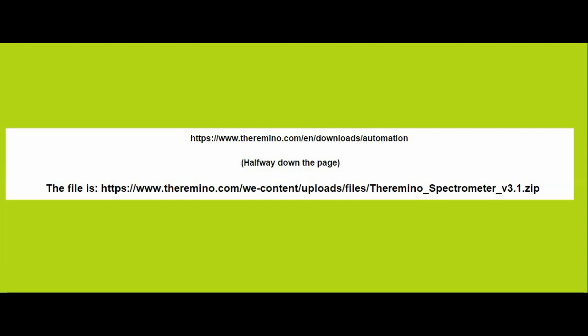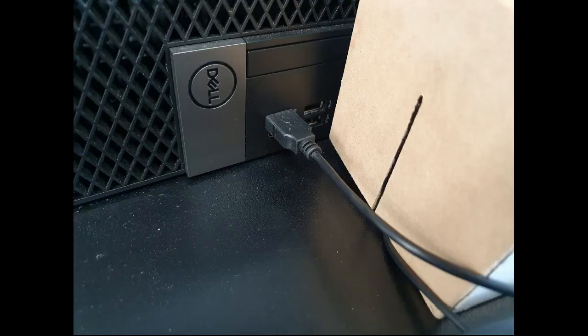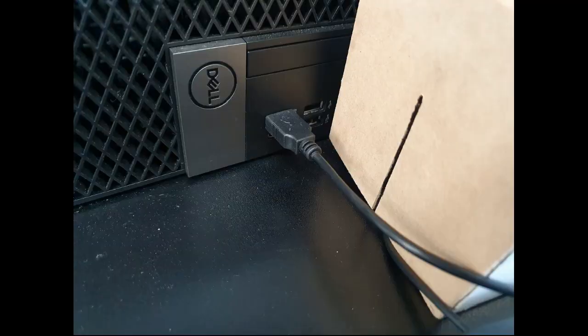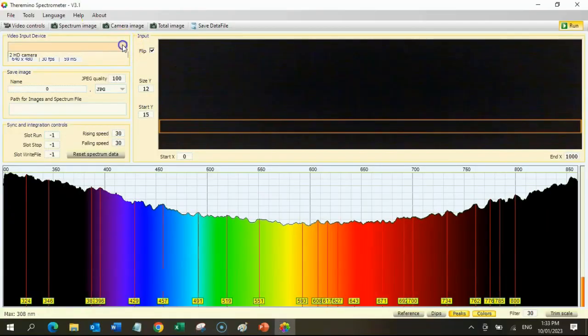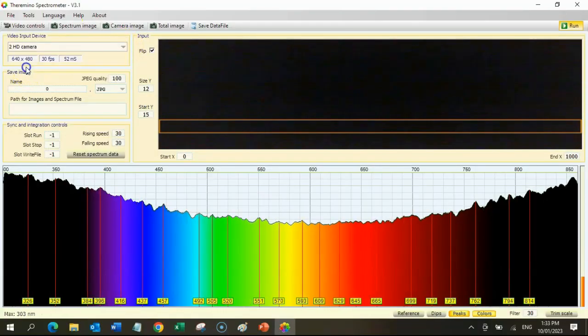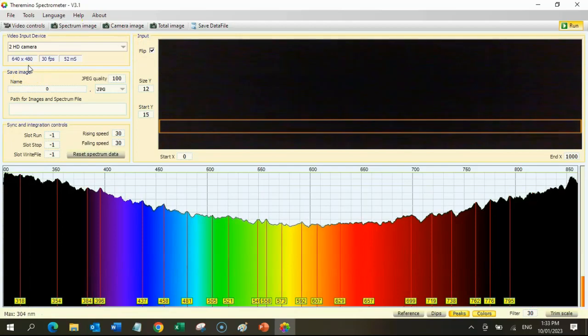Begin by connecting the USB port, then start the software. If you find that there's no camera at the top left, try restarting the software.